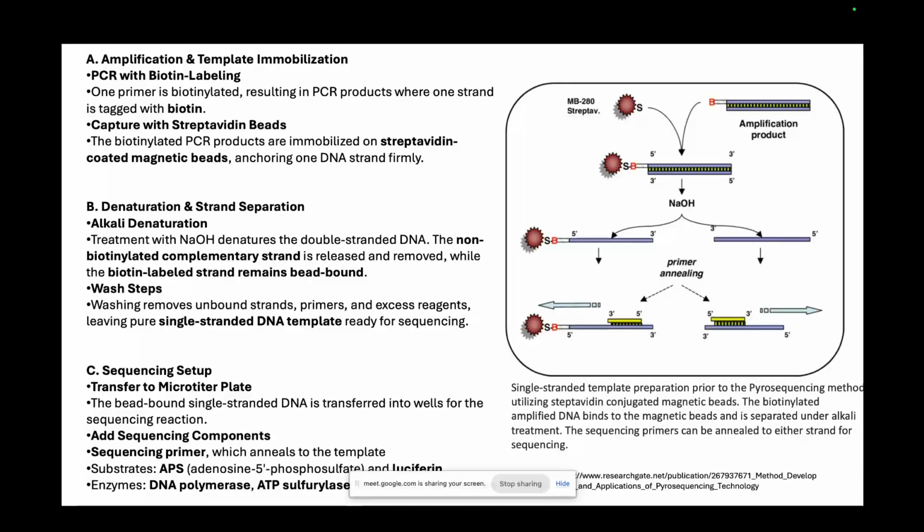It's basically similar to what we use in Illumina. If you remember the video that we saw in the last session, there is always a template primer strand attached to the flow cell, and you also attach an adapter to your read. That read will come and bind to the flow cell, because the adapter added to the read and the primer on the flow cell are complementary, so they come and attach there. Similar functionality is seen here.